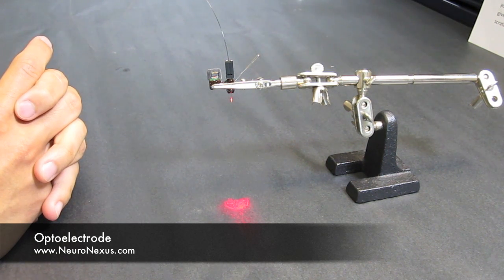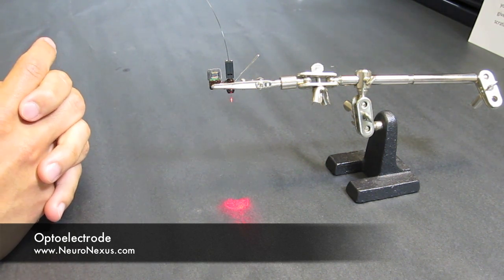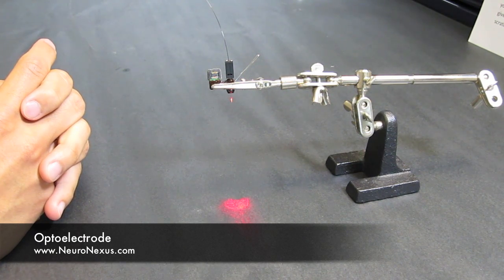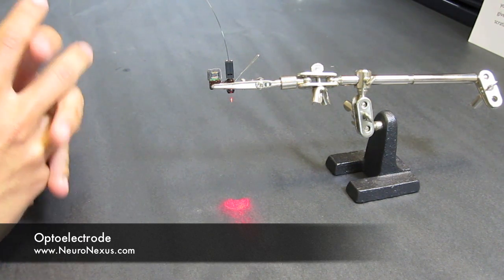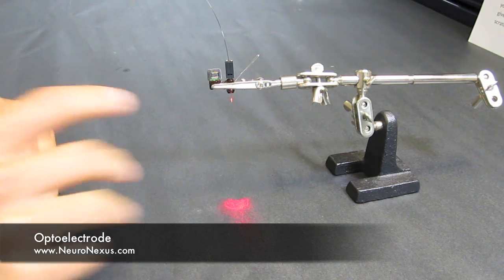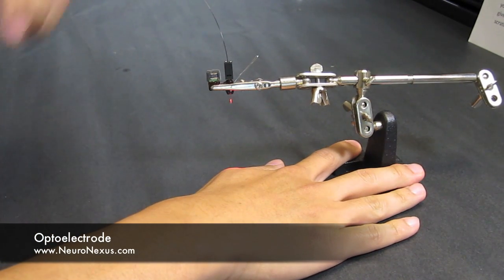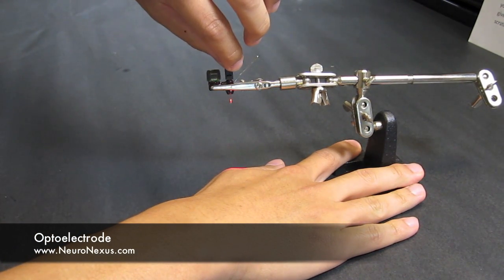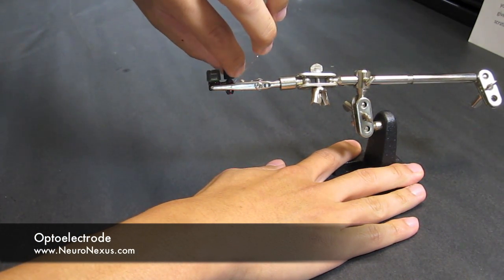Scientists working with awake behaving animals should appreciate our disconnection scheme. What we strongly recommend is this: Hold the animal still with one hand and with the other, rotate the female housing 180 degrees and pull.